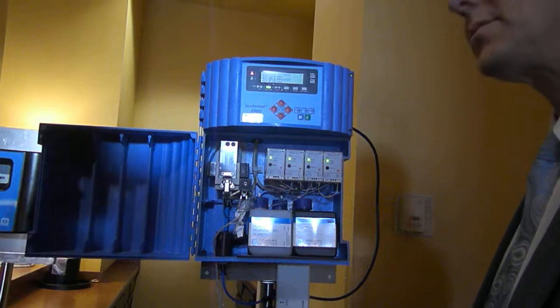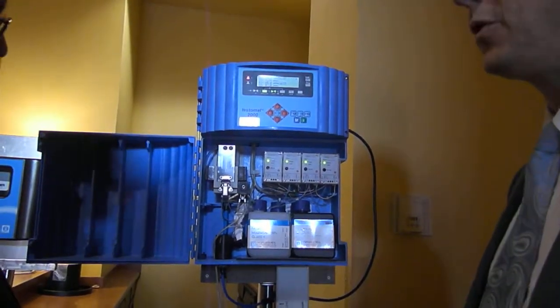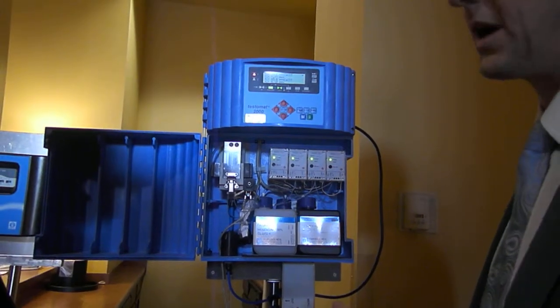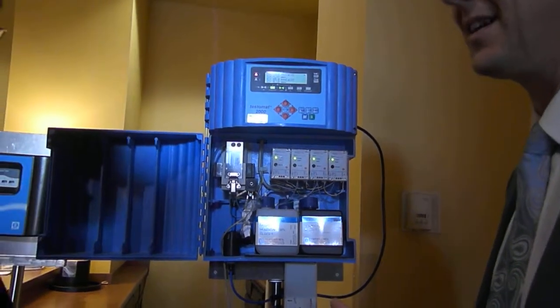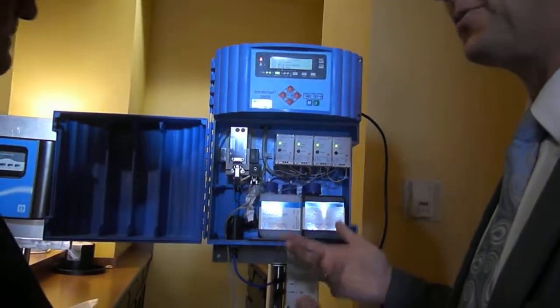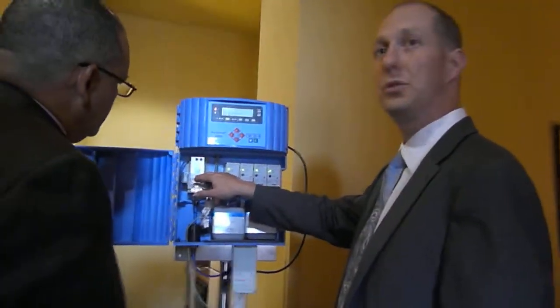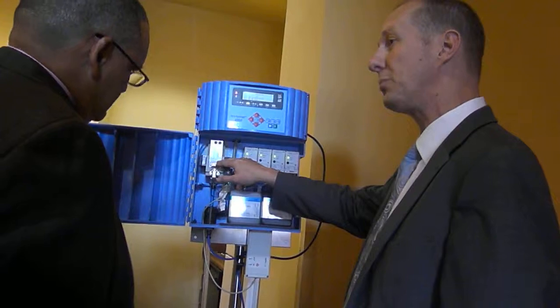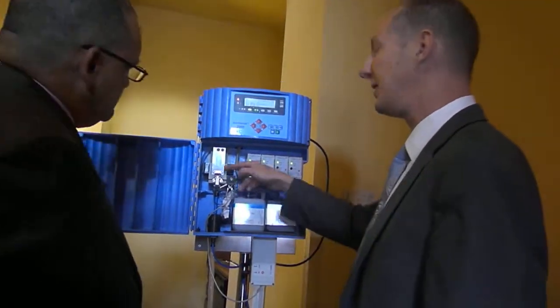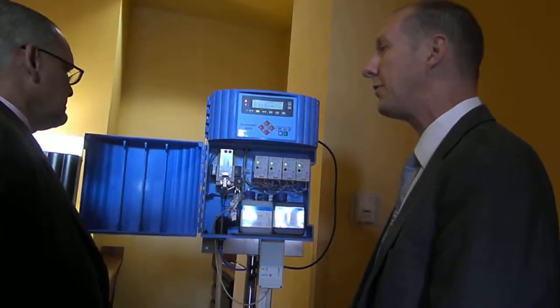Oh really? It's clean enough? Industrial water is clean enough. If you take waste water then we have to look at how dirty it is. If you have grey water or very dirty water we might have problems making the measurement, because when the water is too dark the light will not go through, or not enough light will go through.